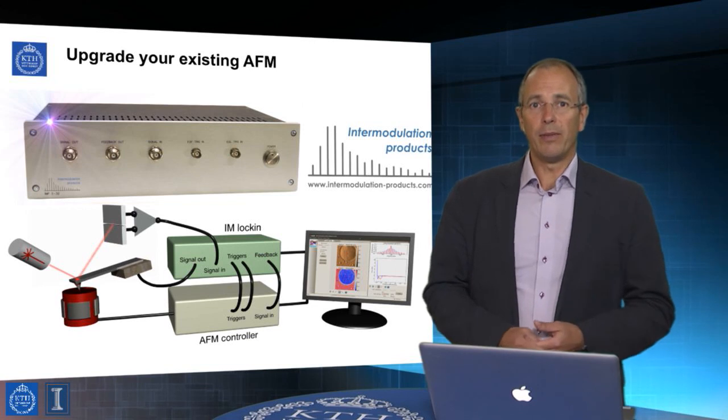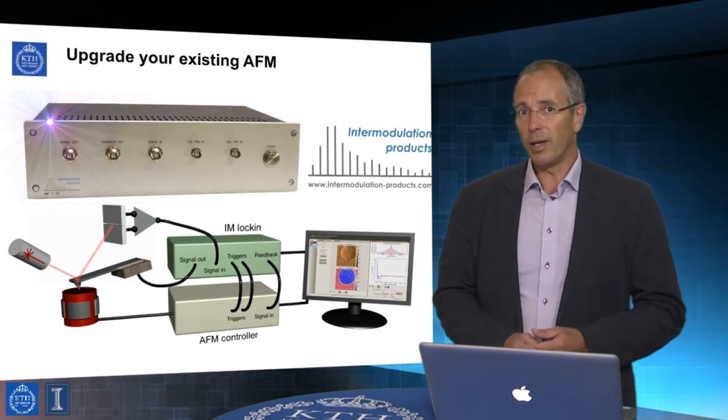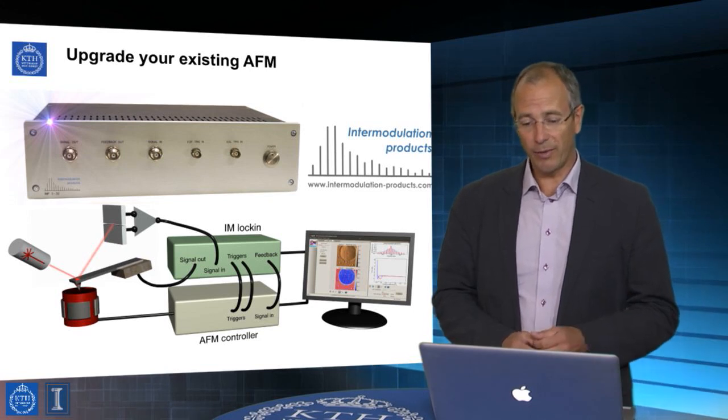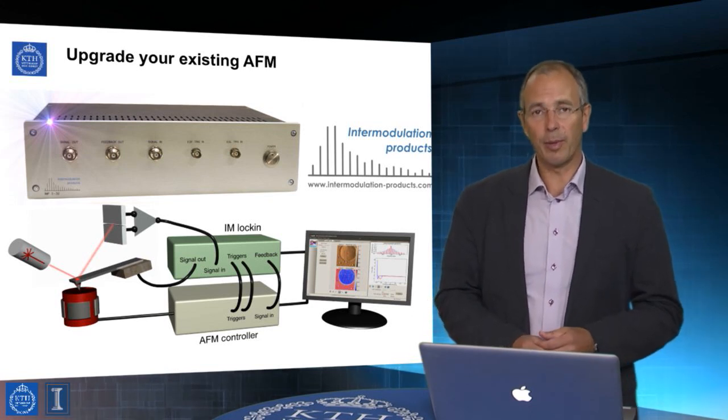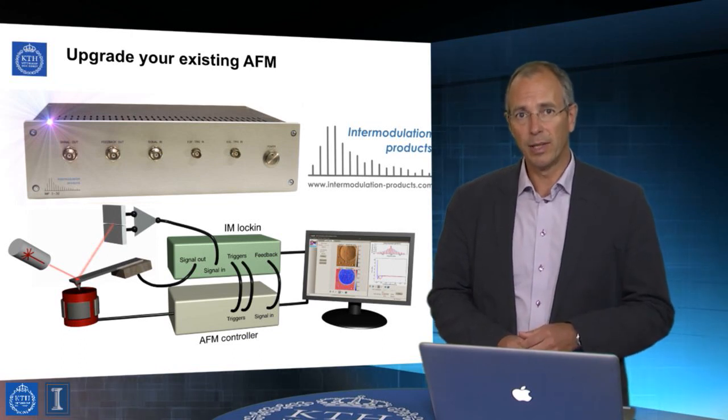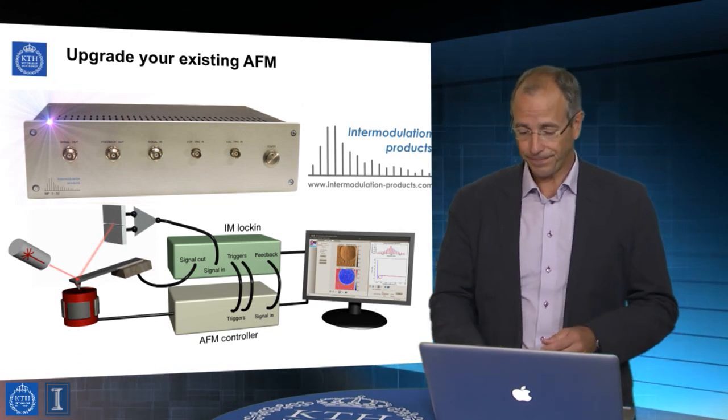And the good news from David is that, of course, you can upgrade your existing AFM with his technique. You don't have to buy a new AFM. It's something that can be applied pretty much to any AFM if you want to achieve this sort of nanomechanical information.